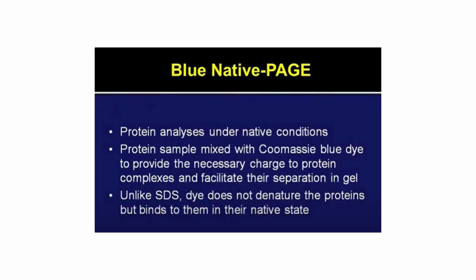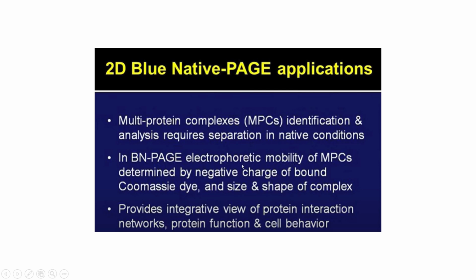Then there is something called blue native PAGE, or native PAGE, where SDS is not used. The dyes do not denature the protein but bind to them in the native state itself, and the purification is in the native state. There are other types, like multi-protein complex identification. You can use BN-PAGE electrophoresis, where the mobility of MPCs, which are multi-protein complexes, is determined by the negatively charged bound Coomassie dye. The dye is negatively charged, and that's what helps in the separation here.